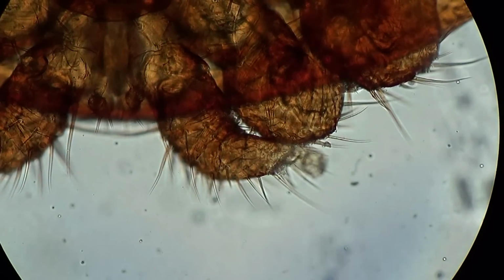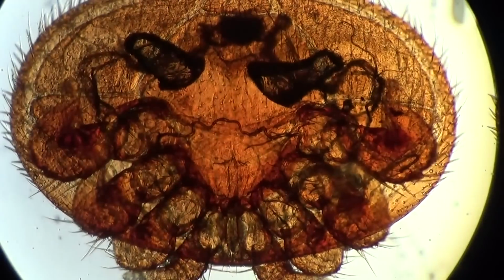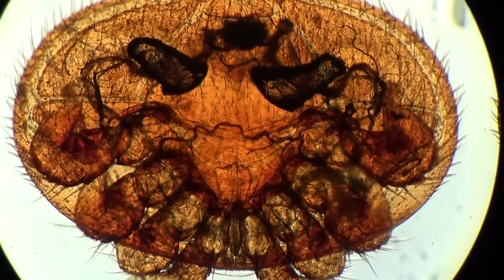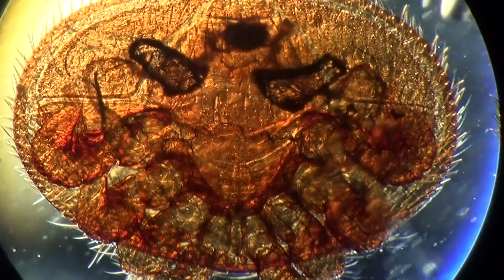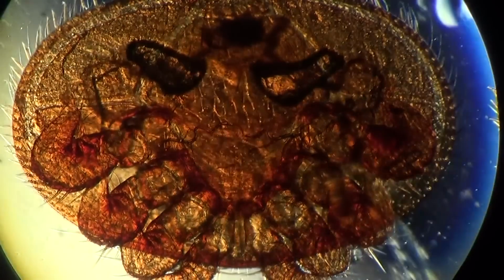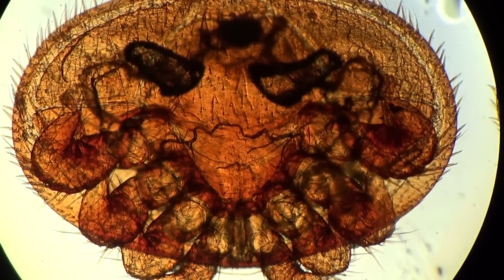400, and I reduce it. It will be 200. Well, this is the frontal part of a mite, and then, well, this is the mite. The mite Varroa destructor, which is the reason and the source of a very dangerous disease, varroosis. Well, Varroa mite is an external parasitic mite, which develops on honeybees, Apis cerana and Apis mellifera. And I show you it now under the magnification 100, just 100.